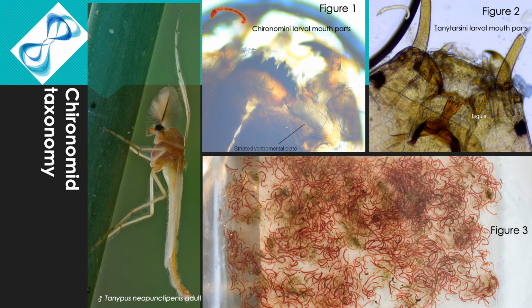Midges are in the family Chironomidae and are often called chironomids. Larval taxonomy below family level is typically only taken down to subfamily or tribe. However, experts can identify midge larvae to genus and on occasion species. Larval mouthparts are required for taxonomic ID.